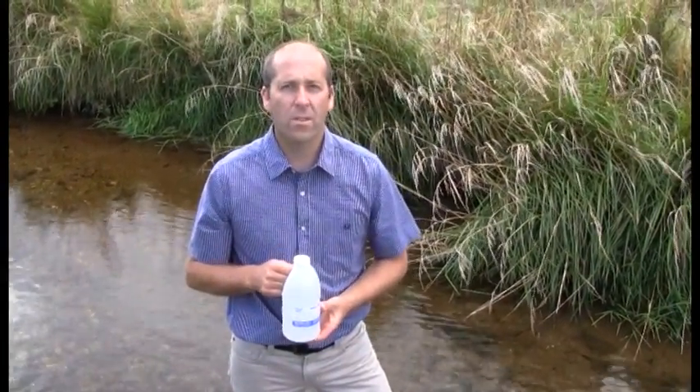Once we've got the samples, keep them cool in a chilly bin and get them to the laboratory within 24 hours for analysis. You can get sampling bottles from any local laboratory. If you have any questions or want more information regarding sampling, please contact me on the number below.